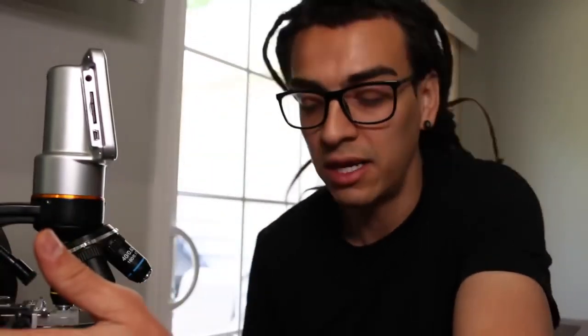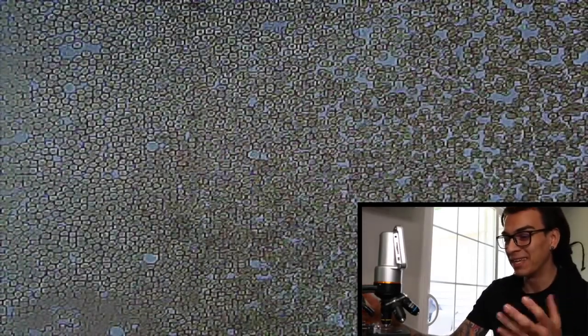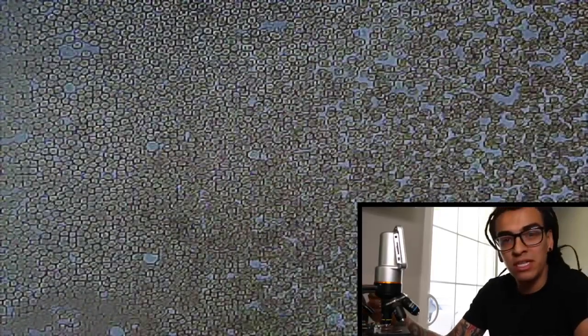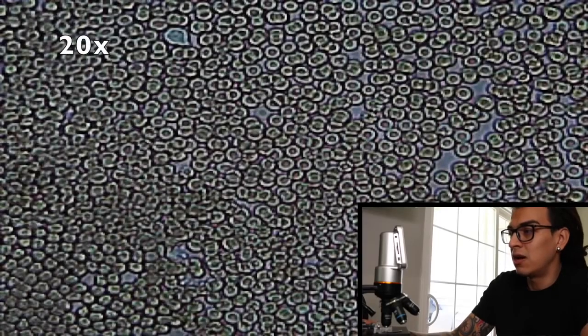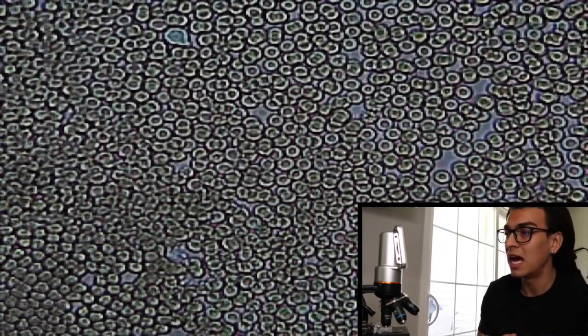So let's see how my blood cells are right now. So I just woke up, right? I just woke up. I didn't drink water last night because I knew I was gonna do this video today. So I wanted to be the regular person that doesn't drink as much water before they go to sleep. So right now we're at 10 times zoom, and you can see that my blood cells are really not moving at all, which means that I'm really dehydrated, and this is how my blood is right now. I'm gonna go ahead and put it on to 20 times, and you can see my blood cells individually, but they're stuck together and not moving, guys.